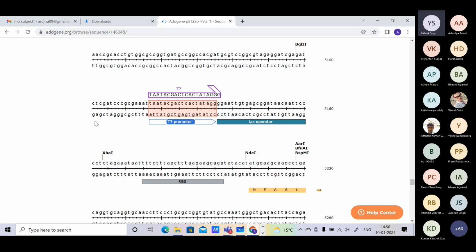So that doesn't matter. If I tell you to write from 10 base pairs upstream to the last one, and you take it from, say, T, it's perfectly okay. There is no problem about it. But until and unless you are sure, you have to understand what the region of interest is, rather than the exact nucleotides. What matters here is whether you are getting an understanding of the region of interest. Am I clear?